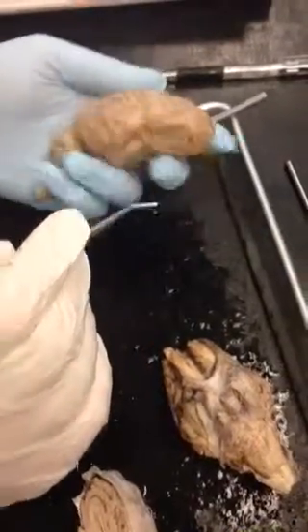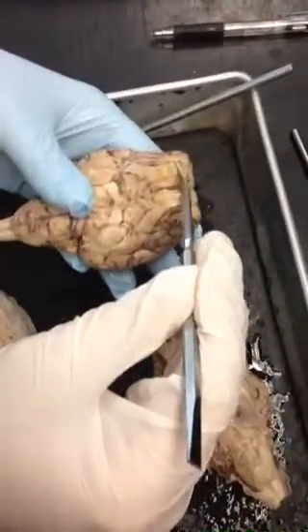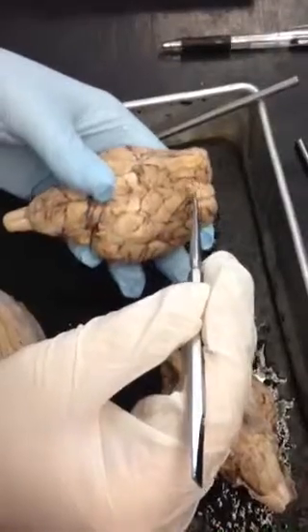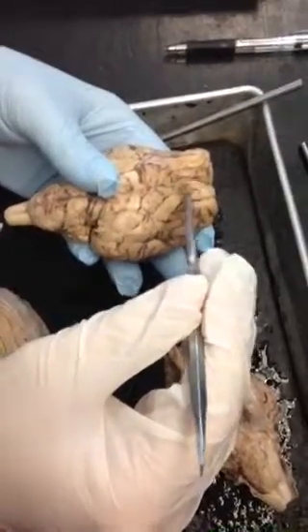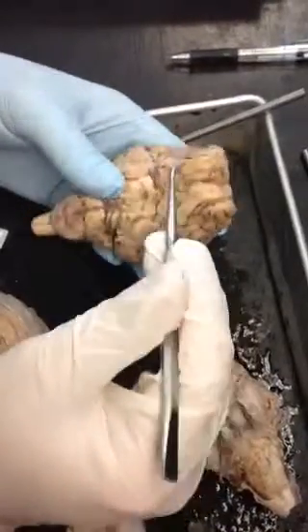Yeah. Olfactory bulbs and tracts. So these are the olfactory bulbs right here. They look kind of like rabbit ears if they're all there and not torn up. And then the tracts are the things coming off right behind it.